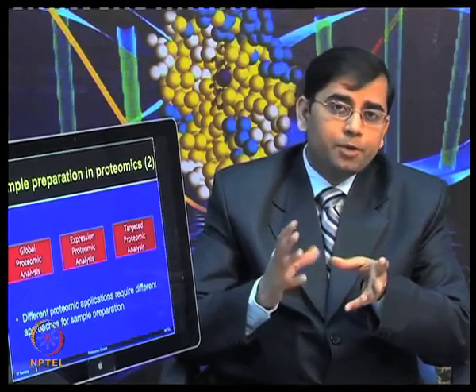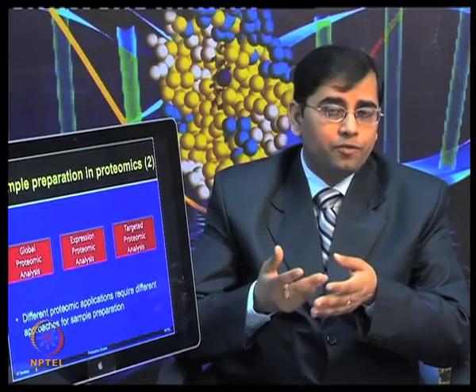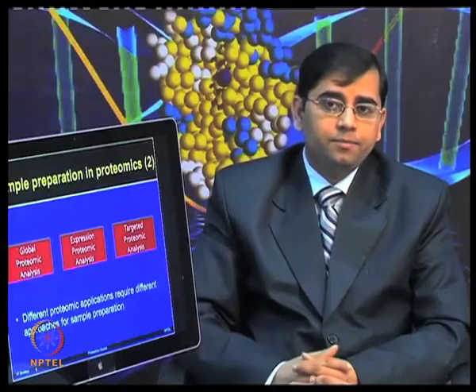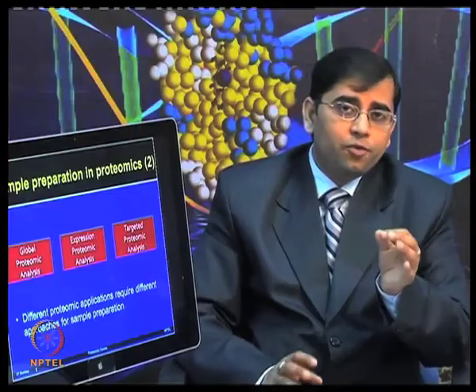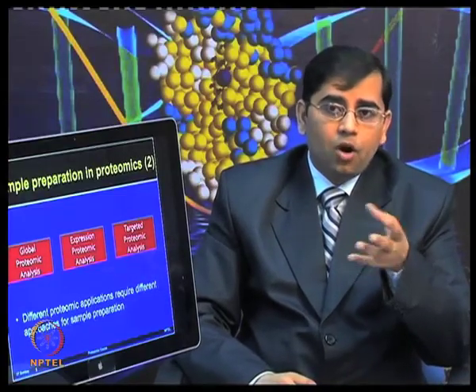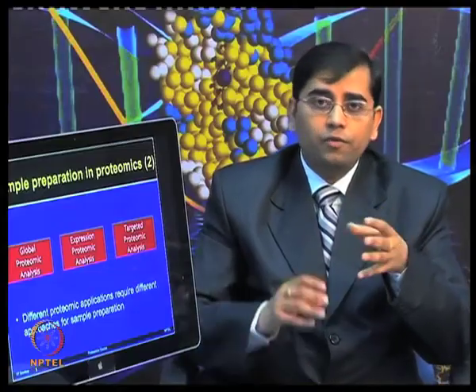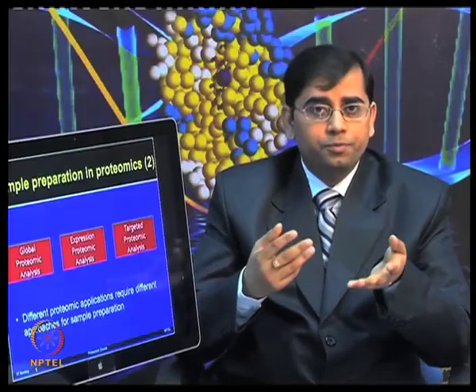So, the protein expression analysis is most commonly used for various types of clinical and different studies. Targeted proteomic analysis, if you are very focused on a given organelle or a given sample type, often you would like to know what is happening in that particular proteome, for example, the mitochondrial proteome.